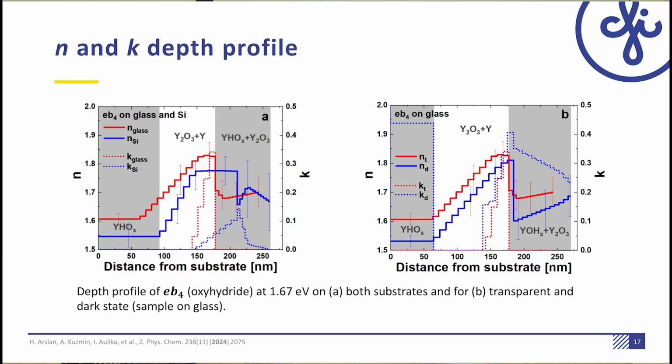We applied an effective medium approximation model to adjust the refractive index and extinction values, allowing us to describe the film's complex optical gradients. Of course, the film cannot have free yttrium inside, but the optical properties of yttrium are sufficient to make an effective medium approximation of this complex structure containing varying amounts of oxygen and yttrium.